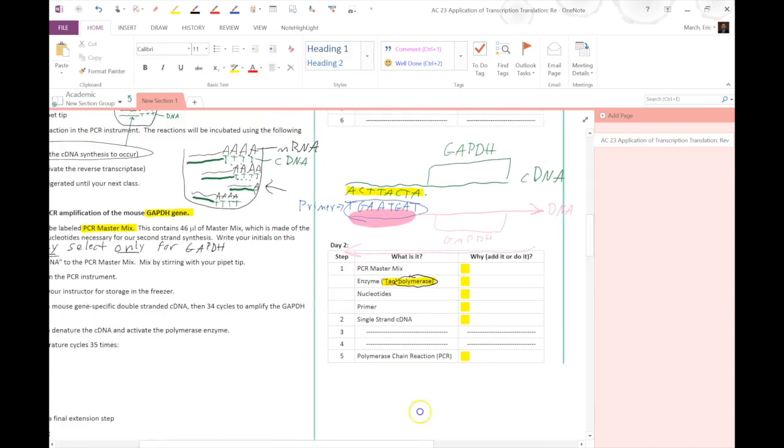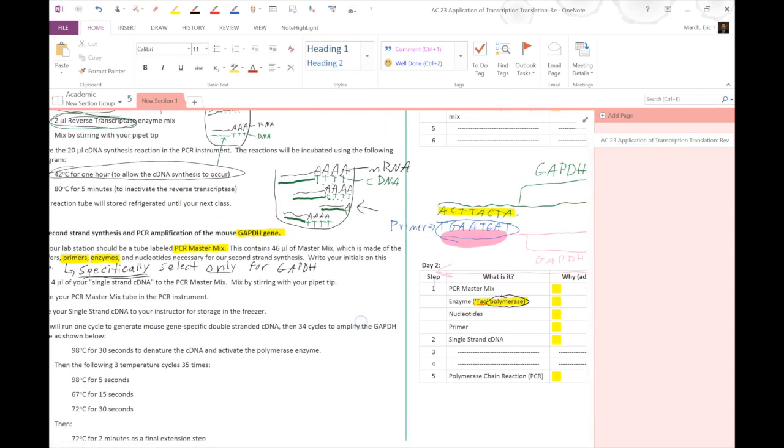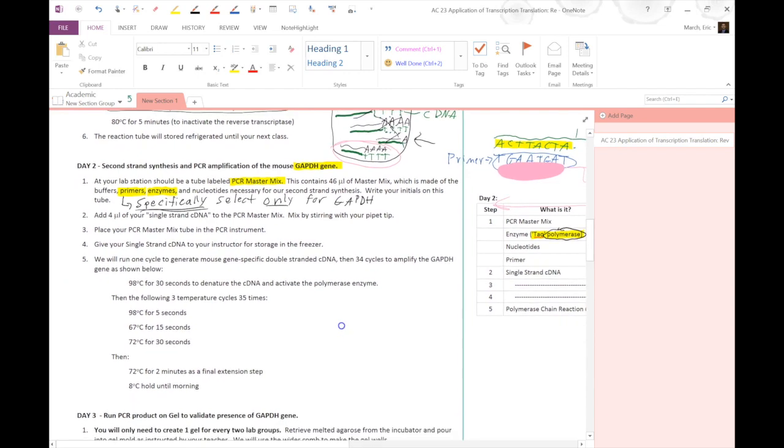But today, all we're trying to do is separate out everything that is not GAPDH. So let's say this is our GAPDH section of cDNA that we want, and we get rid of everything else that doesn't code for the GAPDH gene. And that's what today is.